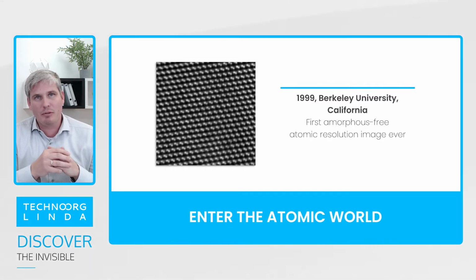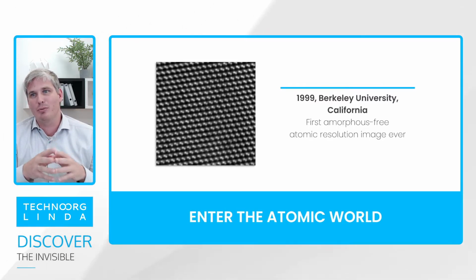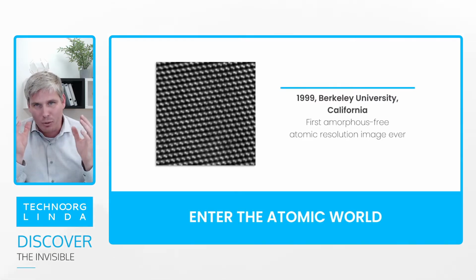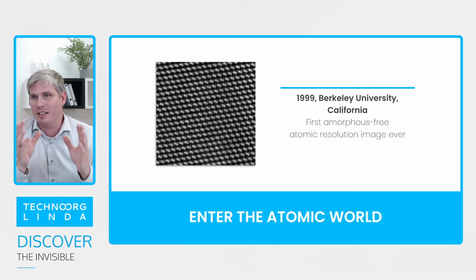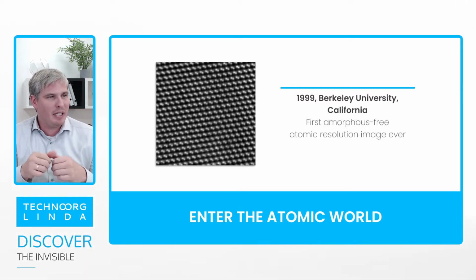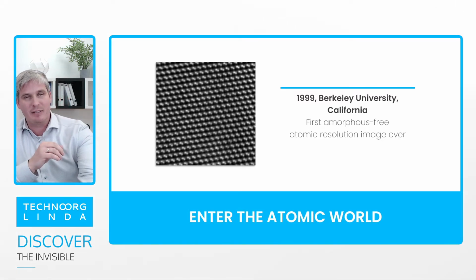So from that moment, scientists were given a new possibility to evaluate completely amorphous-layer-free and damage-free atomic structures. Basically a new era. So yeah, this is the world of TEM samples, and I will ask my colleague to continue and show us some details and nice examples of how and what we can do.